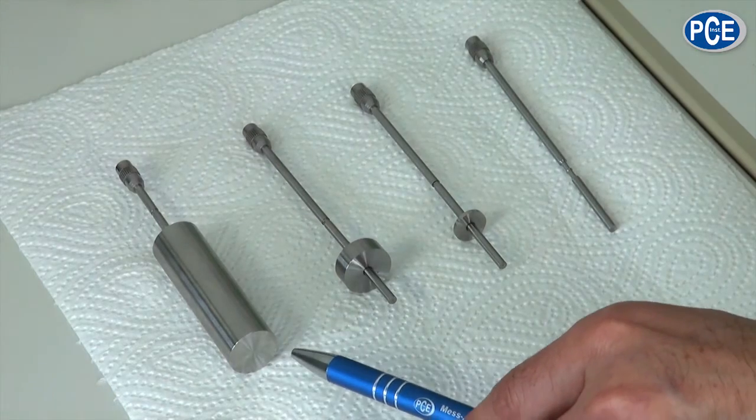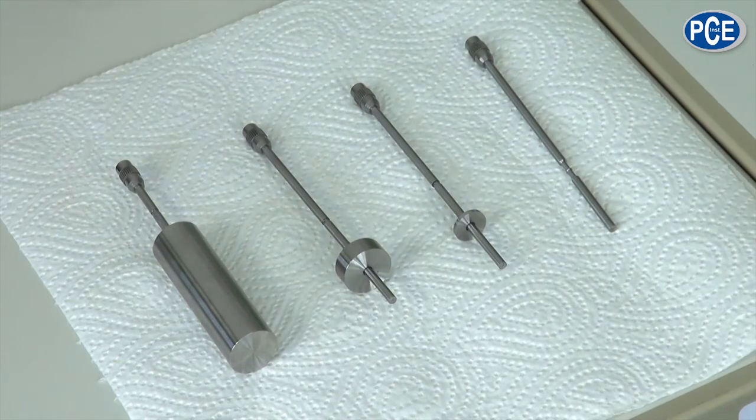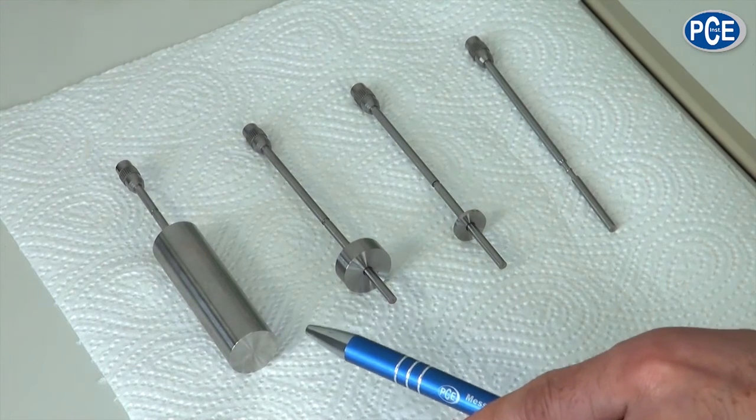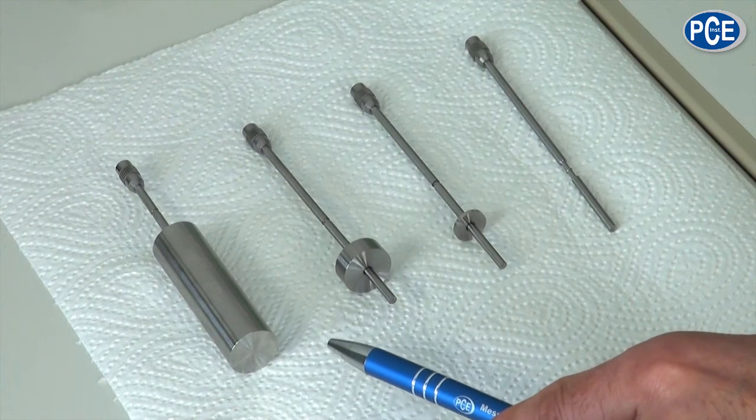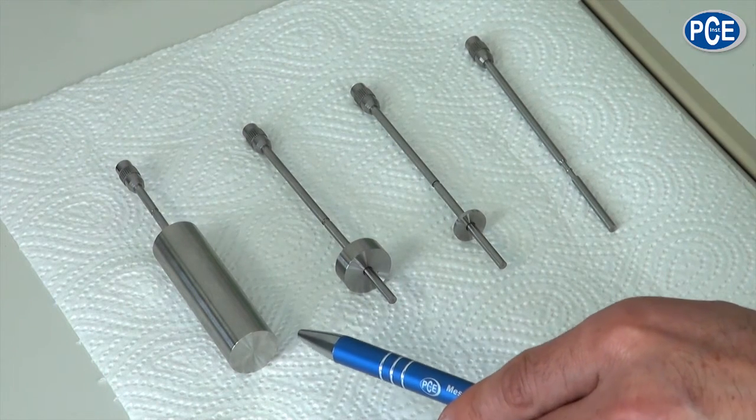The rotation body number 1 is the largest rotation body and is used for the lowest viscosity. It covers a measuring area of up to 1000 mPa·s.